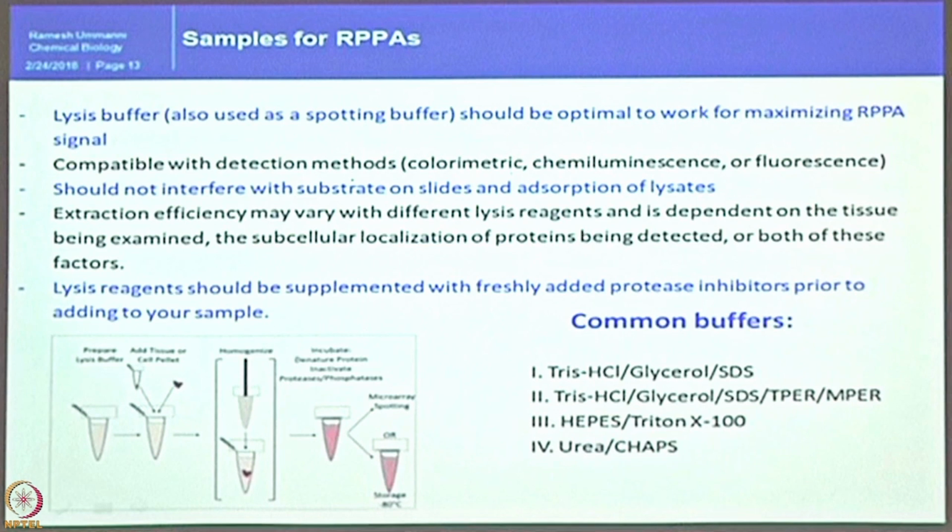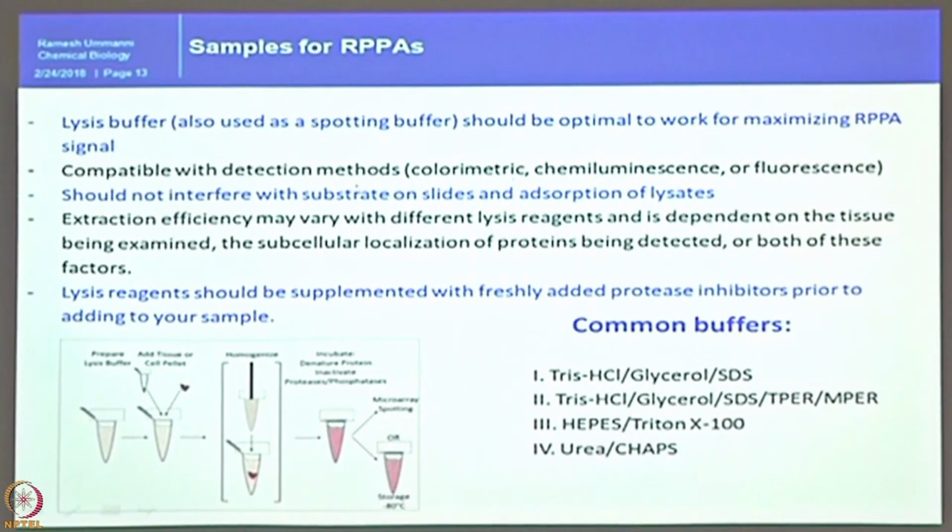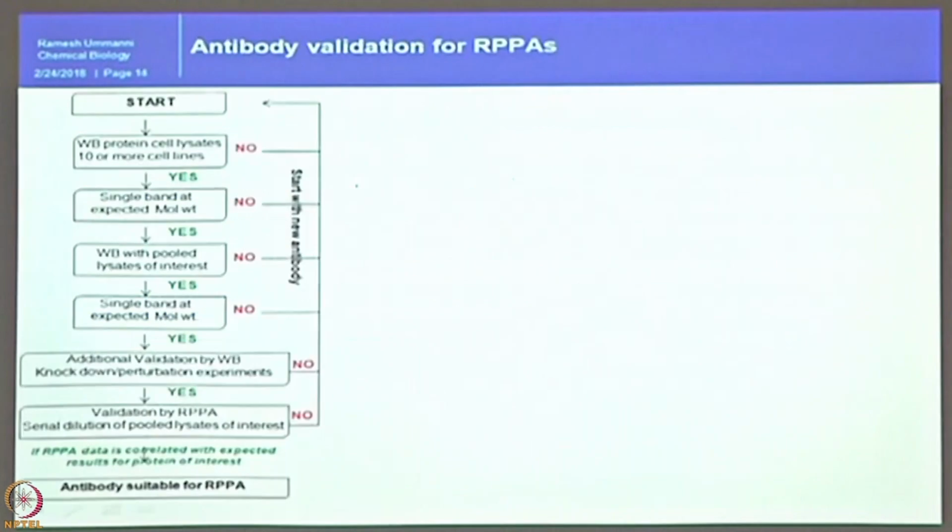So, again, one of the volunteers sitting back was emphasizing that this method is always to be optimized in your own lab, in your own hands, in your own setup. There is no hard and fast rule that so and so teacher explained this concentration, it will work, it will not work. So, you have to optimize, please keep this in mind.